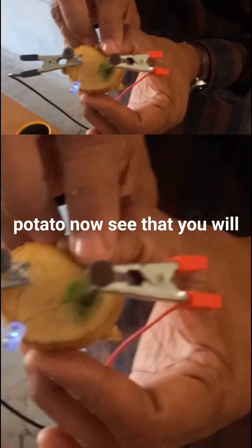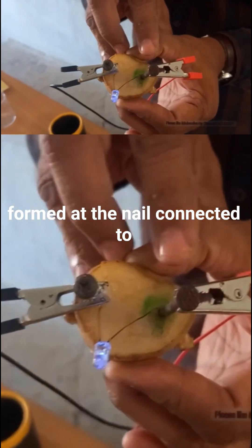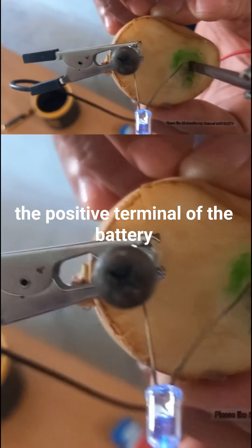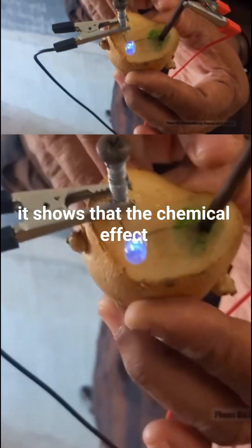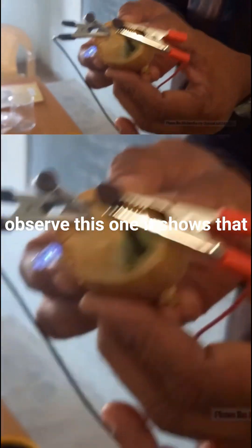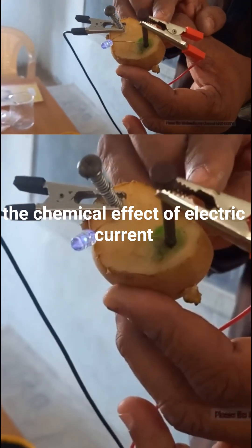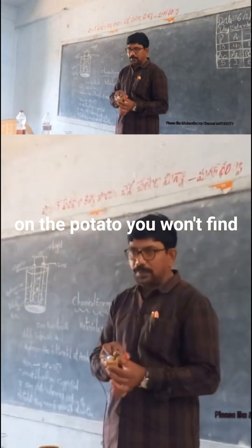You will find a greenish-blue spot is formed at the nail connected to the positive terminal of the battery. This shows the chemical effect of electric current on the potato.